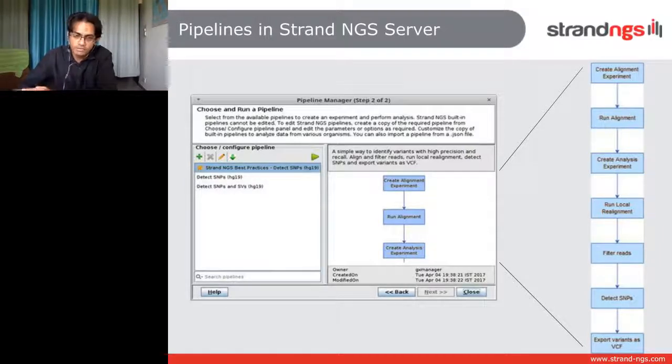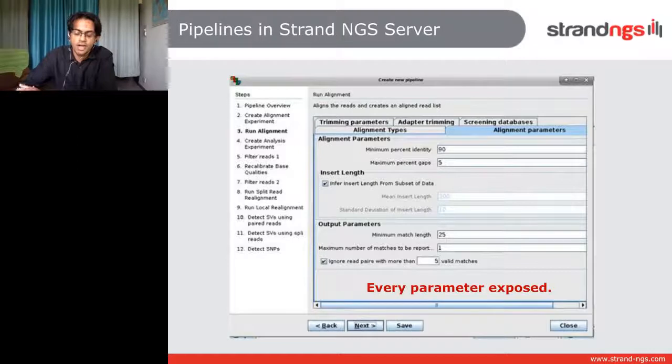The other convenience is that every parameter you see is just right there. You can immediately see it. It's not a problem. If you want to go ahead and change a parameter, you can. If you don't understand what a parameter means, maybe you don't change it, right? I'm just trying to remind some viewers who may not be aware that this is actually a very painstaking process, because if you remember, there are like 12 parameters and there's 15 parameters, and it takes a lot of expertise, but it makes it easier if you just can see everything, especially when you have to do this over and over again, multiple times in order to get things right.